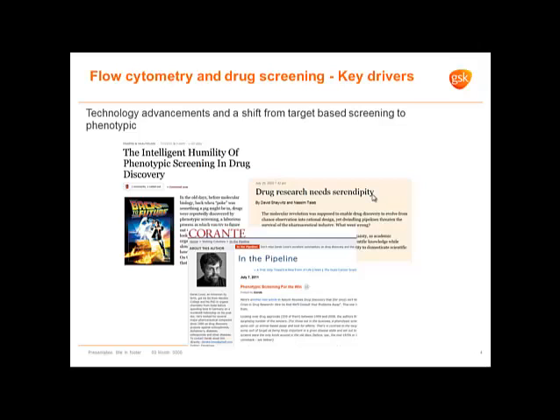Lorenz has already touched on phenotypic screening and some of the applications of flow cytometry. Now, talking about the hype cycles, some changes in technology have started to bring flow cytometry back into the forefront of drug discovery. But the current driver for flow cytometry is this new appetite for drug companies to do things all phenotypic. So this is really pulling flow cytometry into the field of drug screening.